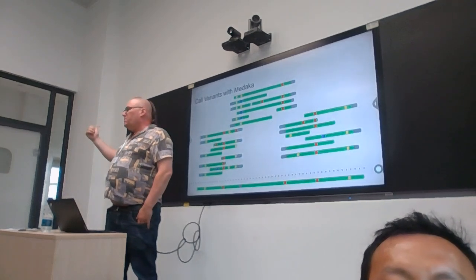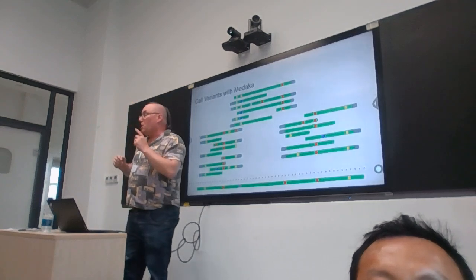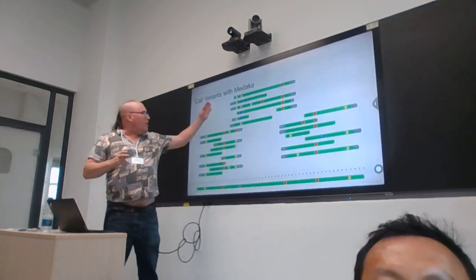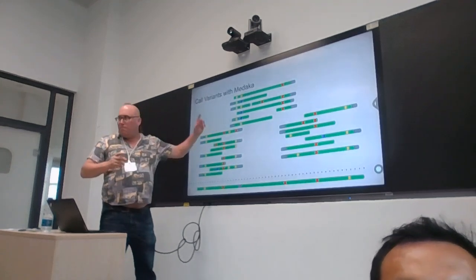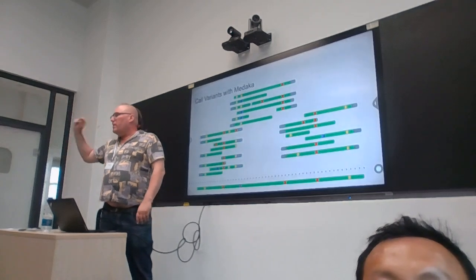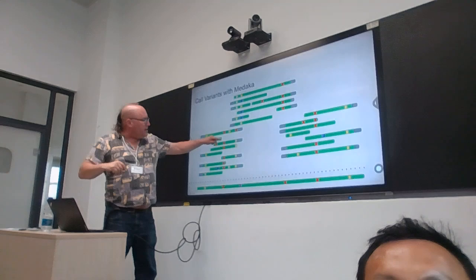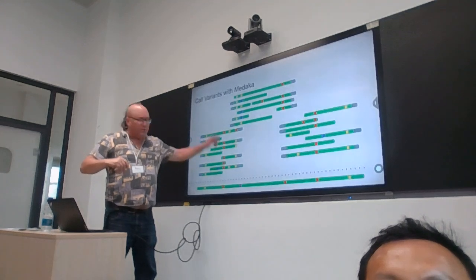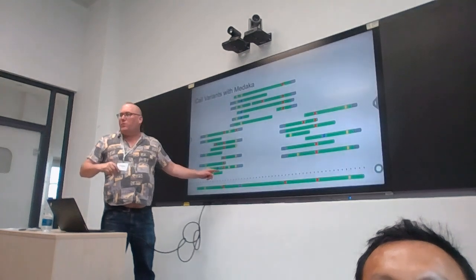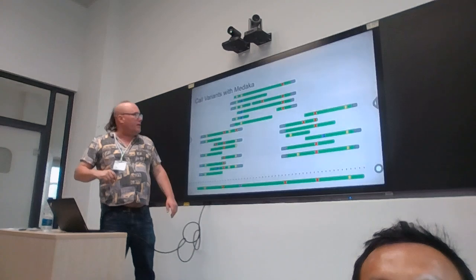Maybe 70% has a G in that position. So now we don't know if it's a C or a G. So we look at the depth here, right? To understand the variance, we look at the depth and what's called the allele frequency, the frequency of the mutation. So here, the depth is 1, 2, 3, 4, 5, 6. Depth is 6. And its allele frequency is 100% giving us whatever the base is. Okay, let's say it's an A.